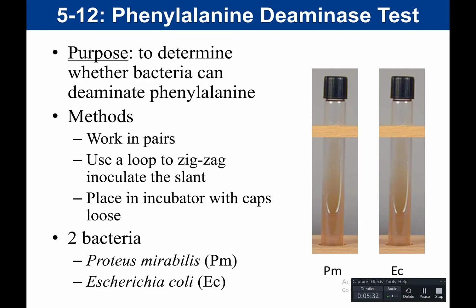Now, phenylalanine deaminase test. You want to know the purpose. The purpose of this test is to determine whether bacteria can deaminate phenylalanine. And so that's all you need to know from this slide.